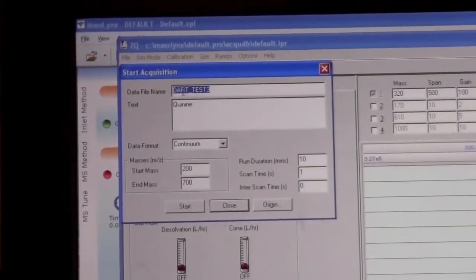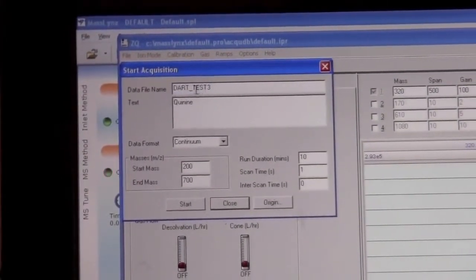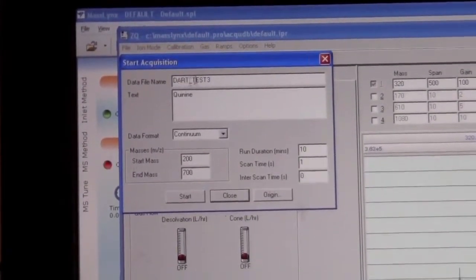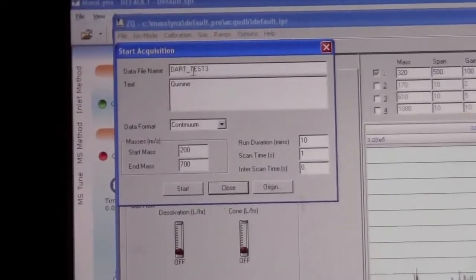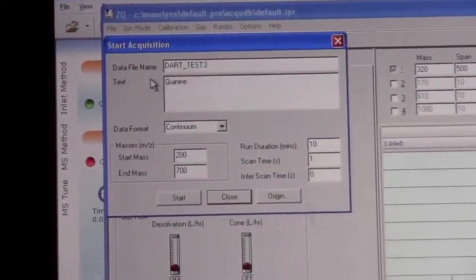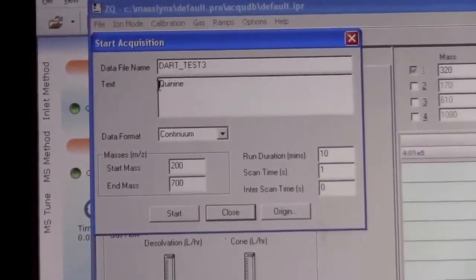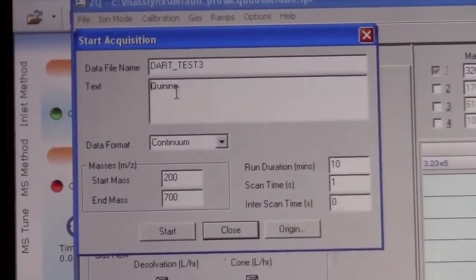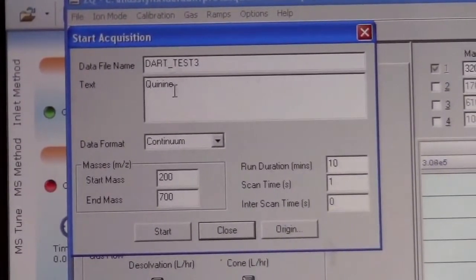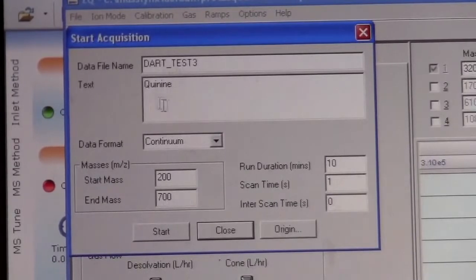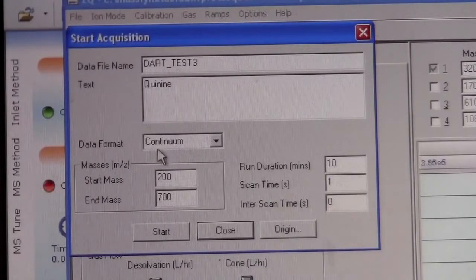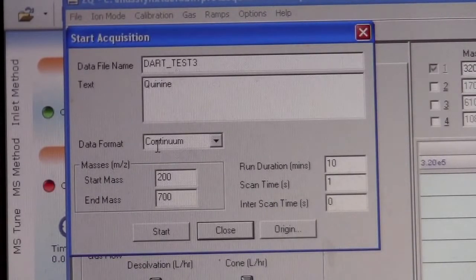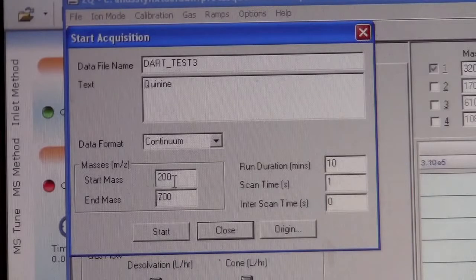Here we can put in a file name. This name needs to be one that's appropriate to be saved to disk. We can put in text based on what we want to have saved with the data in terms of text. Continuum data format.